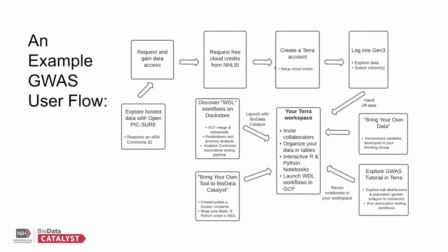So BioData Catalyst doesn't host all of the data that I want for my particular analysis. So I'll have to bring my own data, like some harmonized variables developed by the TOPMed working group that I'm a part of.